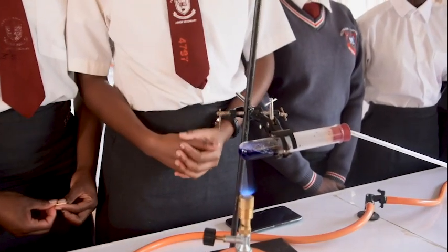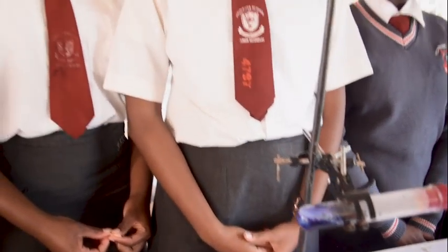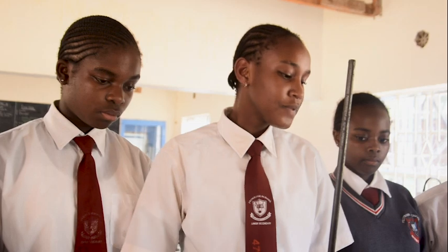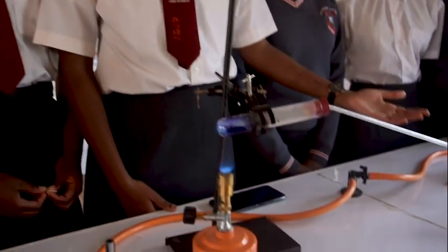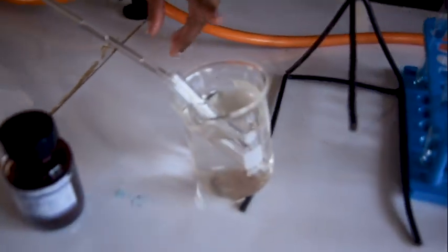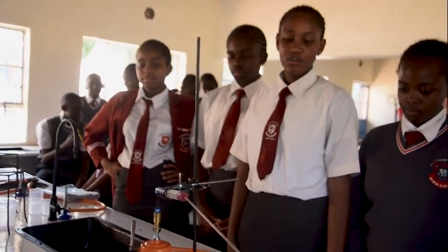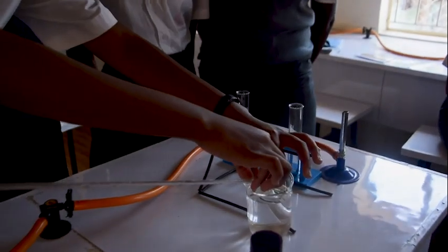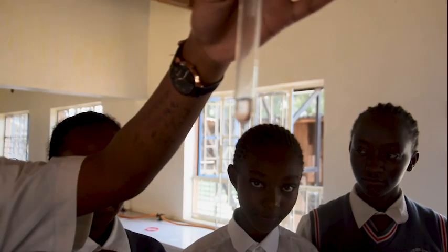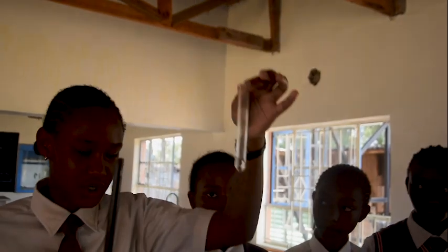As you can see, it has already changed from the pink color to a blue powder, which is still cobalt 2 chloride, but it's anhydrous, meaning it lacks water of crystallization. Afterwards, for cooling, you'll be able to take the water from this test tube and add it to this other test tube to return it to its original form, which is the pink color. So we'll slowly remove the delivery tube. As you can see, we do have the water, and this is the water that was stored in the pink cobalt 2 chloride, which was for crystallization.